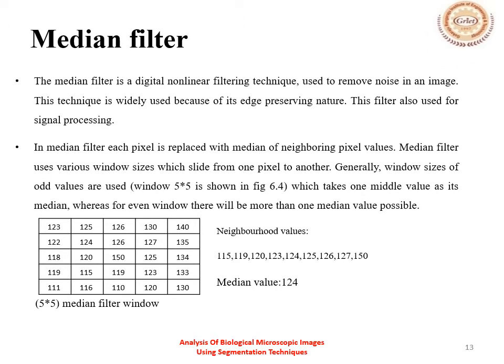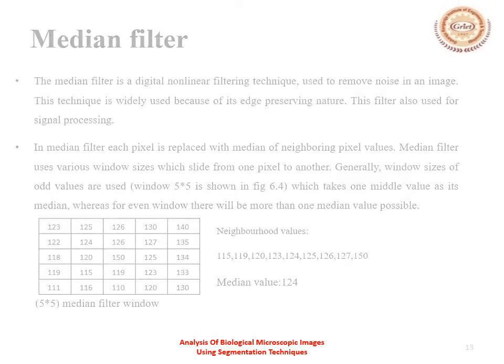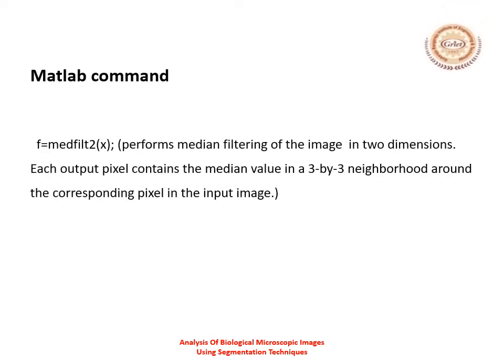The next filter is the median filter. It is a non-linear filtering technique. It is used to remove noise but also preserve the edges. This filter is generally used in signal processing. This is the MATLAB command for the median filter.